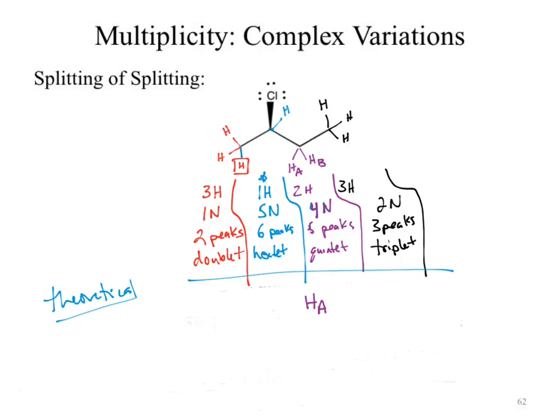It has the 1 hydrogen that's in blue. It has the 3 hydrogens that are in black. And lucky us, it also has our purple HB.